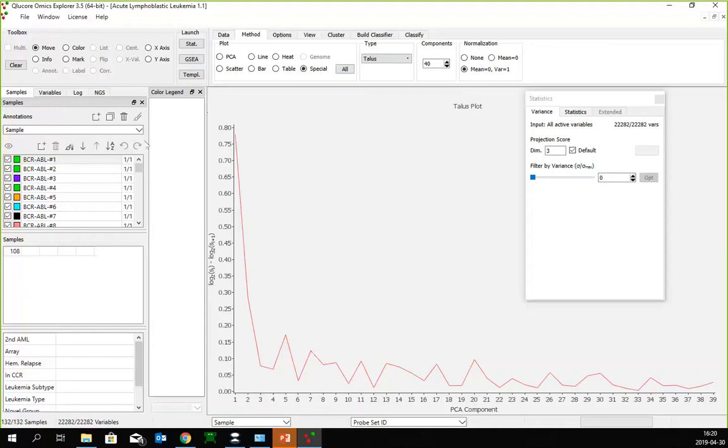And if we take a look at the cheat sheet here, which is an annotation for the data set containing the different subtypes of leukemia that are present among the patients. Here we have 1, 2, 3, 4, 5, 6, 7 groups. These are what we expect to find, and this we actually can see from this last peak here.